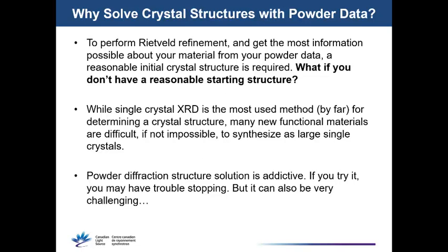Not too big anyway, because bigger than half a millimeter, the single crystal winds up longer than the side of the beam partially, and you get screwed up intensity. Yeah, for lab diameter, 100 micron is the medium size. Okay.